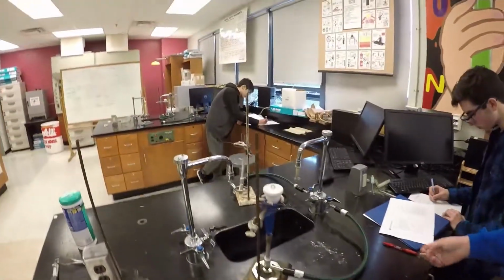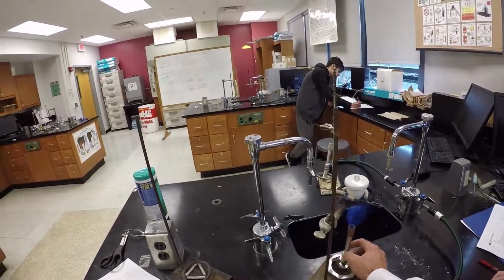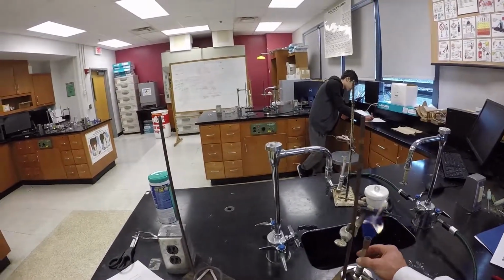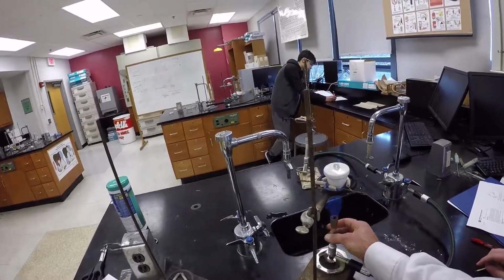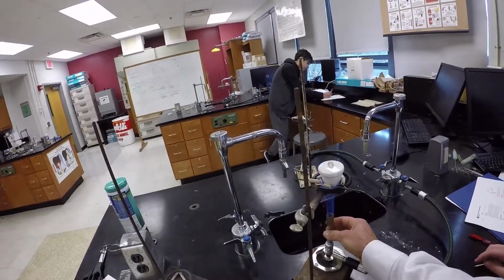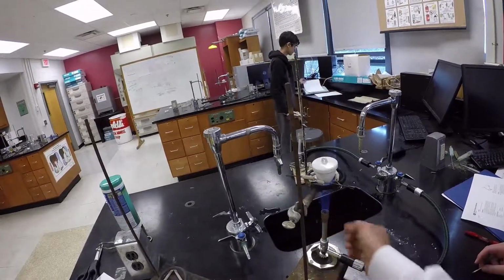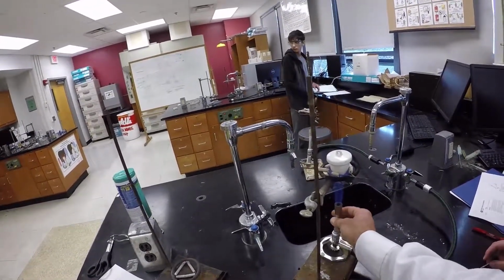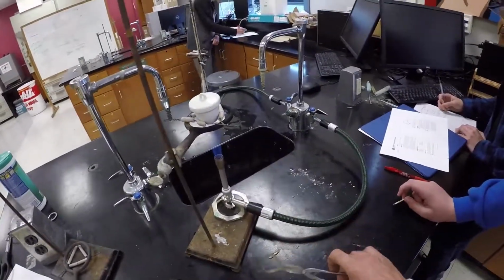Perfect. Now, you can see that the flame is just a tad high. I'm letting a little more oxygen in to give me a cone. Nice cone. The more oxygen you let in, the tighter the cone will be. That's actually getting good. You can see how the metal there is heating up. See how it's red hot now?